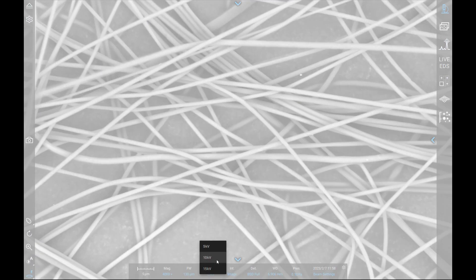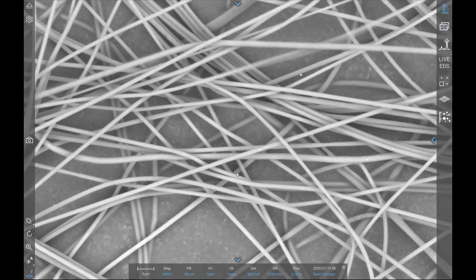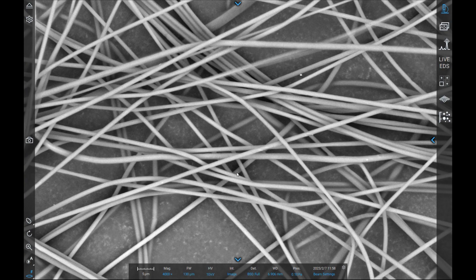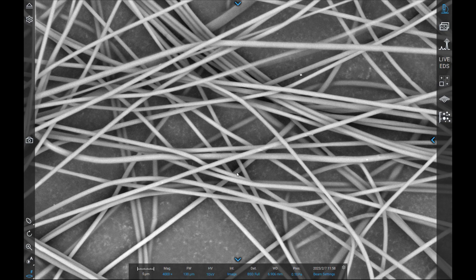10 kV is our best accelerating voltage setting for standard imaging. It generates high signal and very little noise, so provides high quality images. 10 kV is the most used accelerating voltage for most applications including analyzing this fiber sample here.